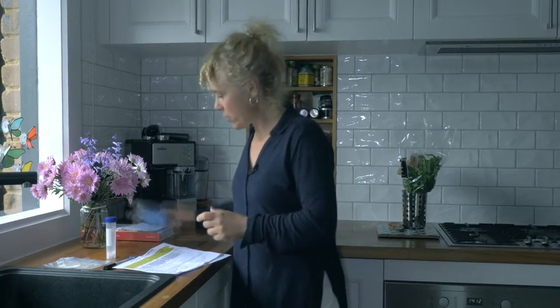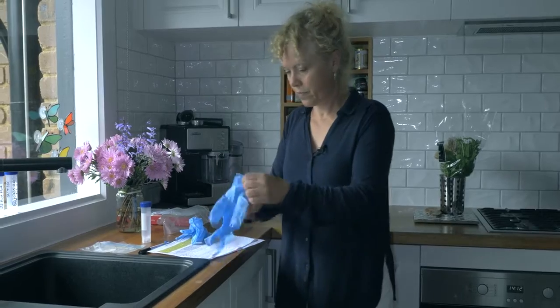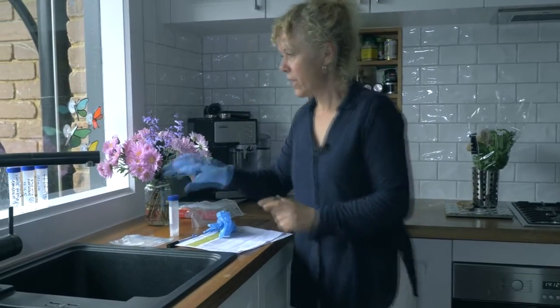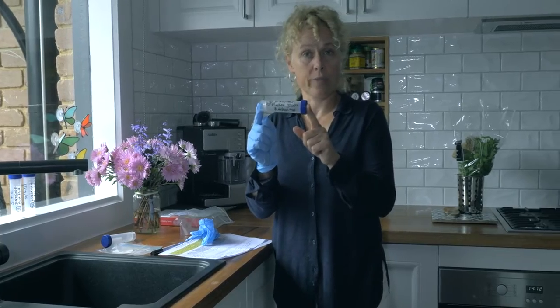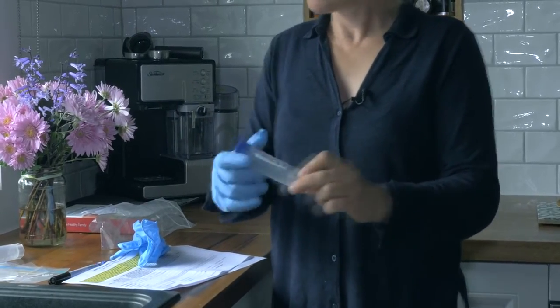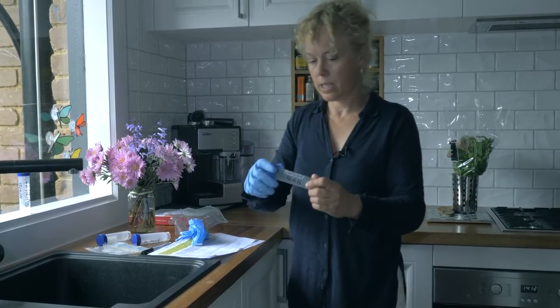So to go ahead, first thing you're going to do, get on the gloves, which normally come with the kit. Wash your hands, put on your gloves. And then I always like to write all of the information on the tube first. I'm going to open this up, and this would generally be done in the morning so it hasn't been used, because this is the first flush sample, which is this one here. So first flush, kitchen tap, date, etc., and the sample number.